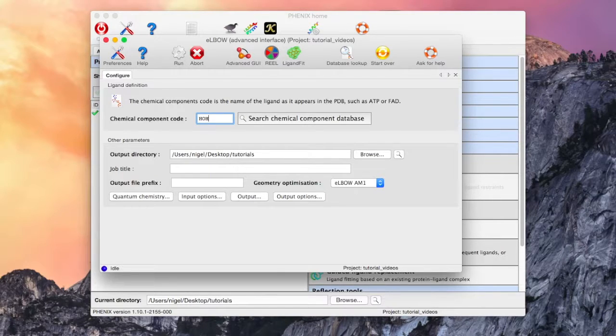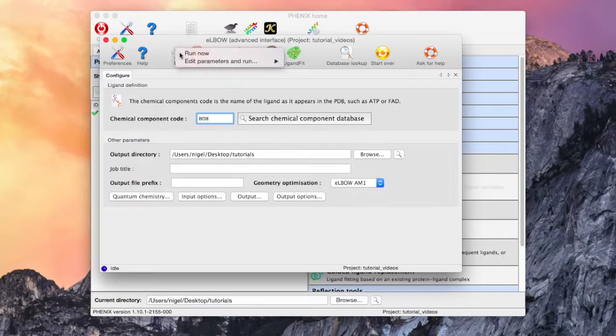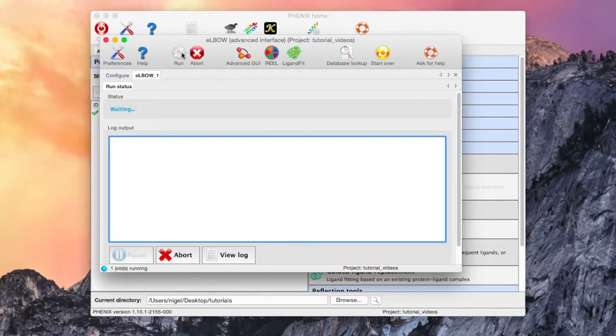So let's enter our toy example, HOH, which is the most common code for water.